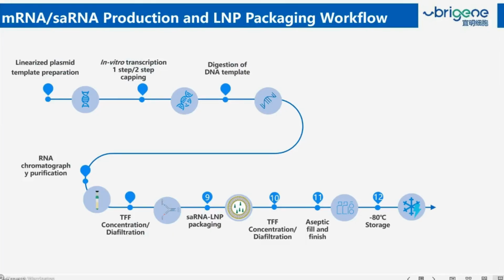Jumping forward into our workflow for mRNA, which is essentially the same as for self-amplifying RNA. In this case, we can also add to the workflow the packaging of these RNAs into LNPs.